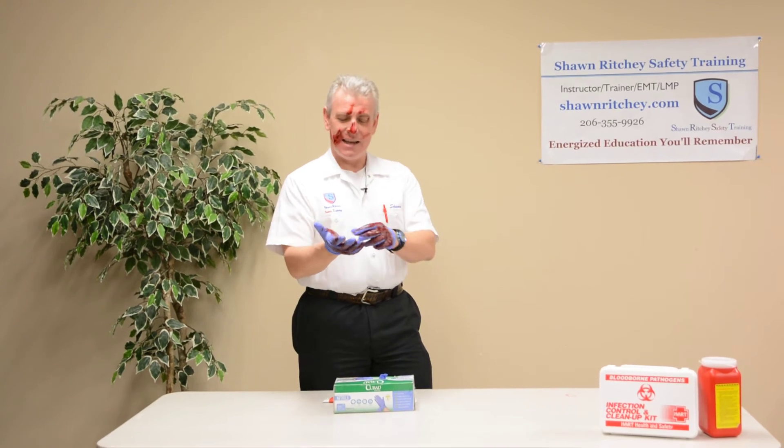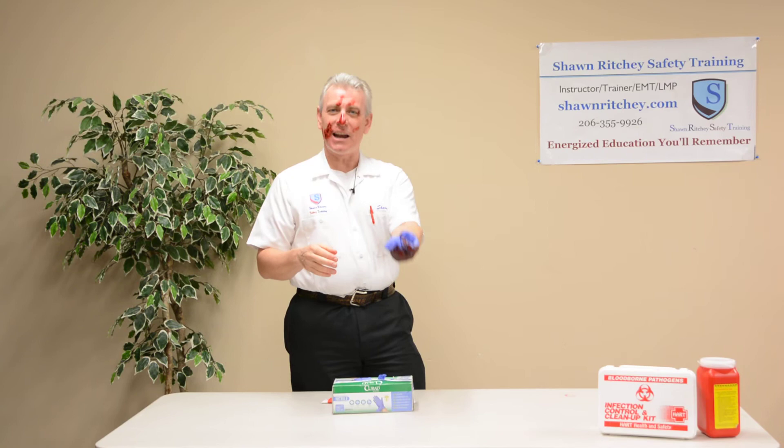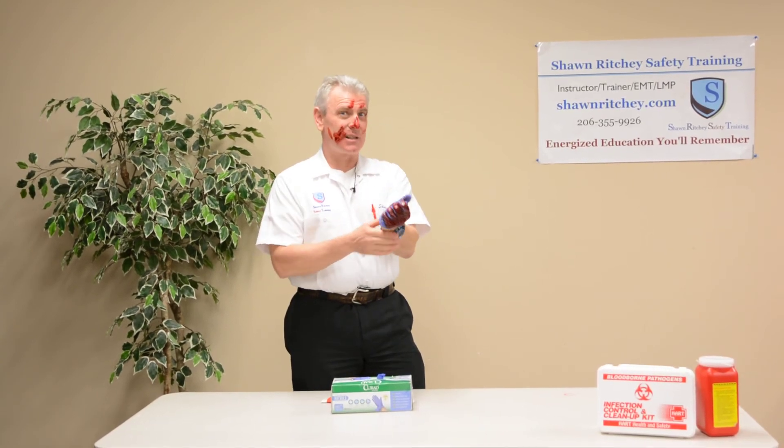To remove contaminated gloves, let's use glove-to-glove, skin-to-skin. That means I grab at the palm of my first glove, pull that off, turn it inside out, and crumple it up in my other gloved hand. That was glove-to-glove.